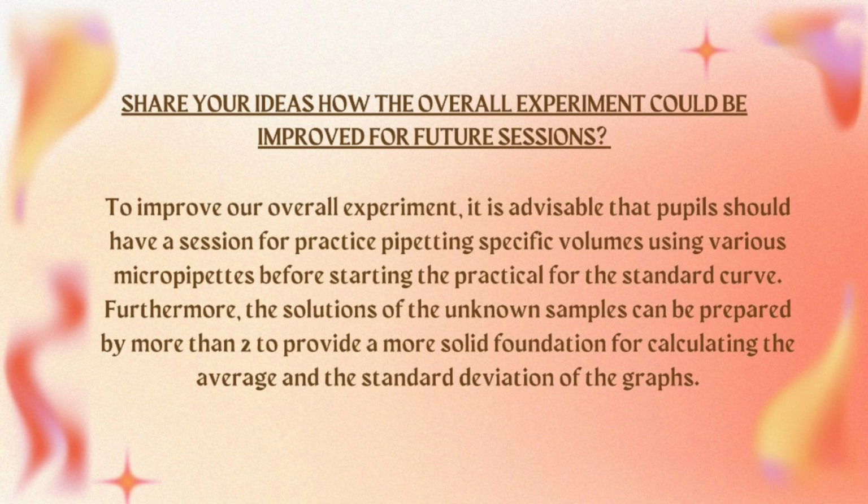Furthermore, the solution of the unknown sample can be prepared more than twice to provide a more solid foundation for calculating the average and the standard deviation of the graph.